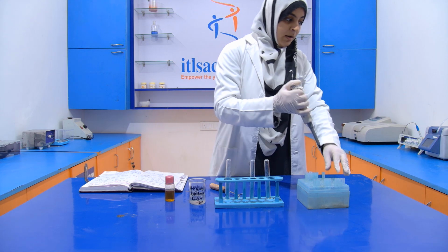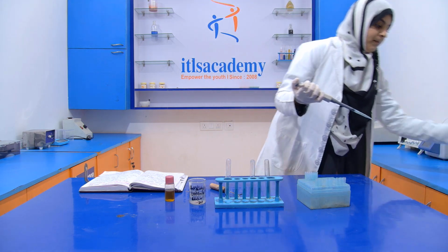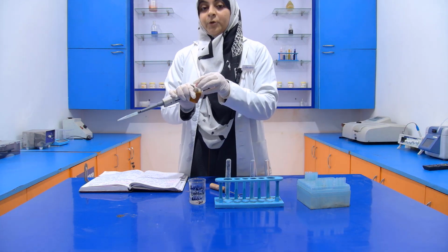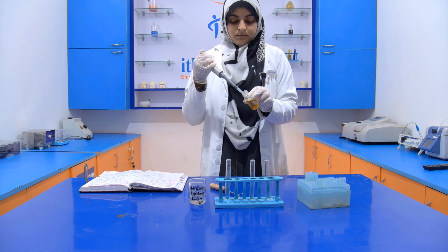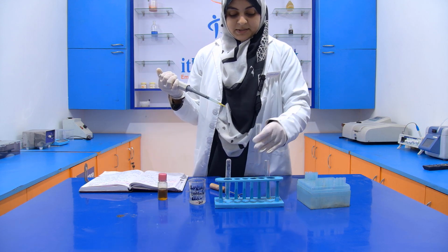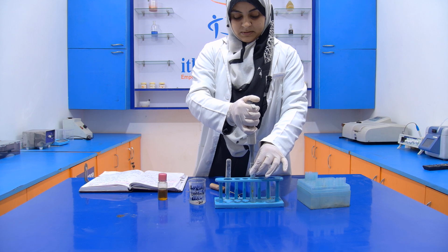Now first of all, we have to take a sample. You can also take only 1 to 2 drops. Take a test tube, add the sample.